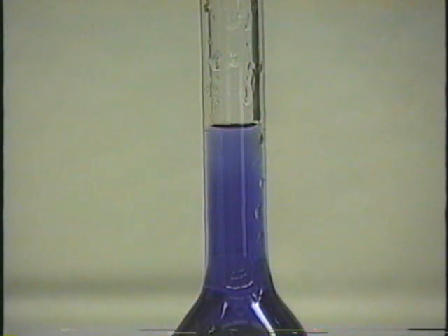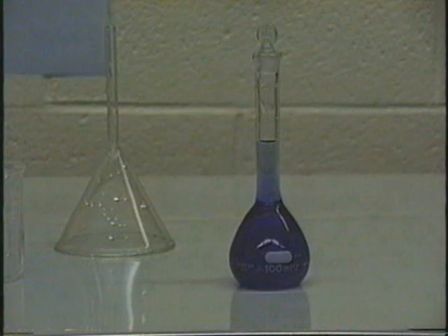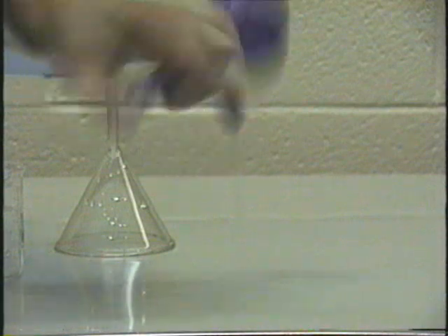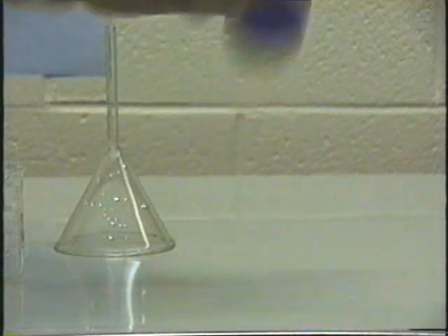Now, cap it and we'll shake it. To mix it, hold the stopper firmly and shake vigorously about 12 times. When you're through, you'll be all set to start making solutions to measure in the spectrometer.